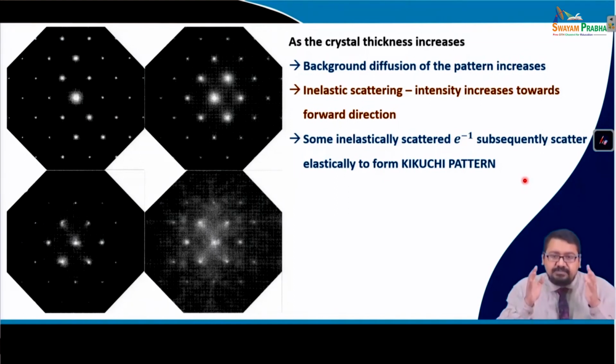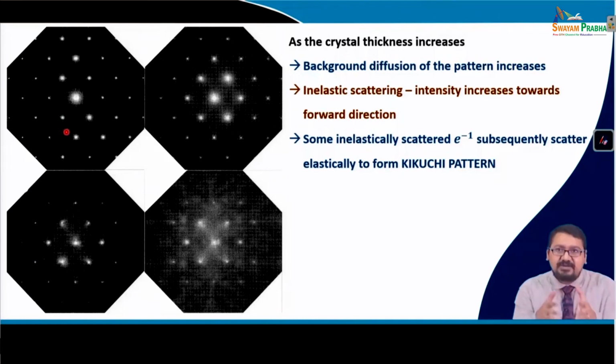So, on the other hand, we can get a spot pattern which looks like this, with a large number of spots from which we can observe what crystal structure it is. We can rotate the specimen holder, put it in a certain zone axis, observe the diffraction spots and find out information about it, like whether the material is nanocrystalline or has larger grains, or has some deviation in the crystal structure, like that.